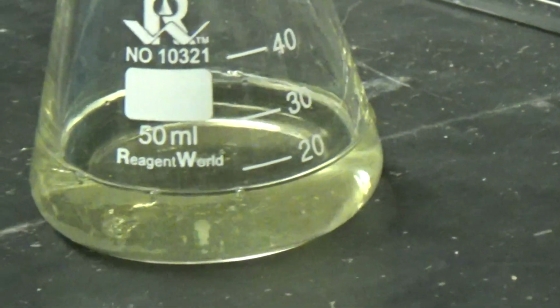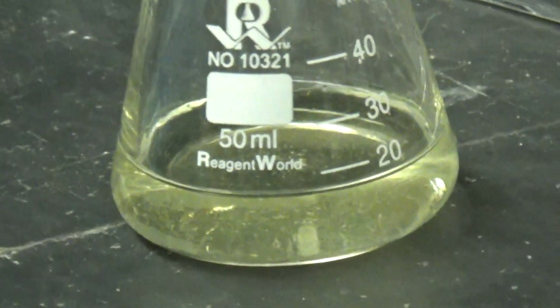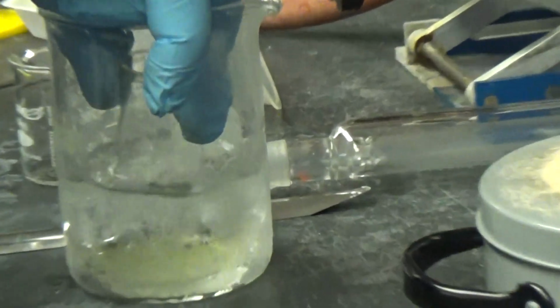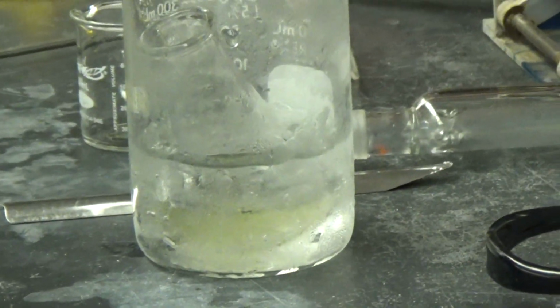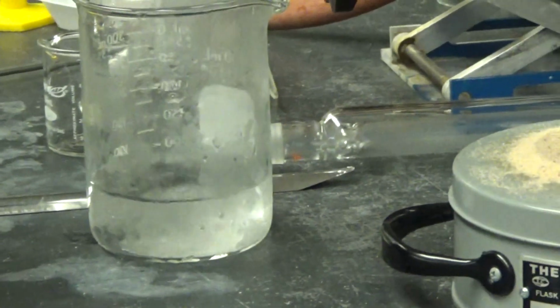Still waiting, and do we see anything? No. Don't see anything yet. Alright, so now you're putting it in ice, and that'll maybe accelerate crystal growth. A little ice water, nice cold surface. It starts to come slowly.